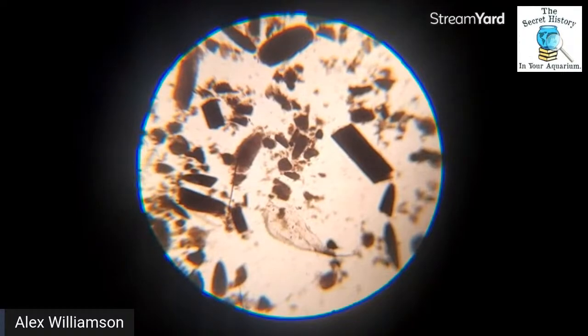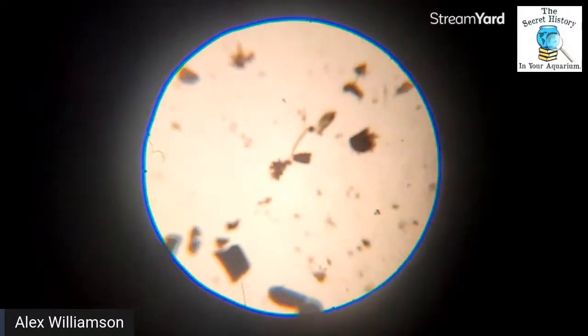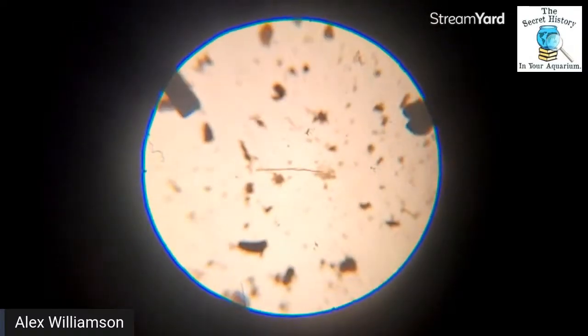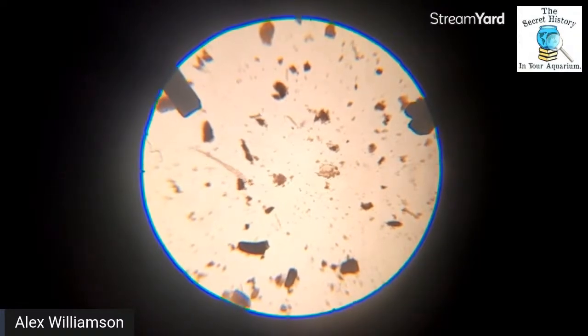And all those little broken square pieces are either plant cells, though usually they'll be translucent, so then they're castings from shrimp and snails and fish. And that's what's making up your mulm. So we're looking for any big critters. And look, yet again, it looks like we've got one stuck on a piece of algae or something. So let's zoom in and see what's giving this guy a bad day.